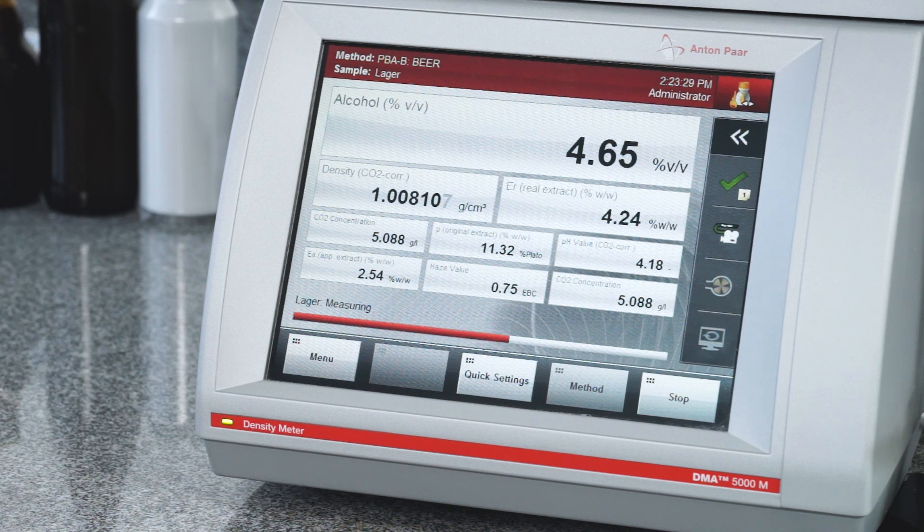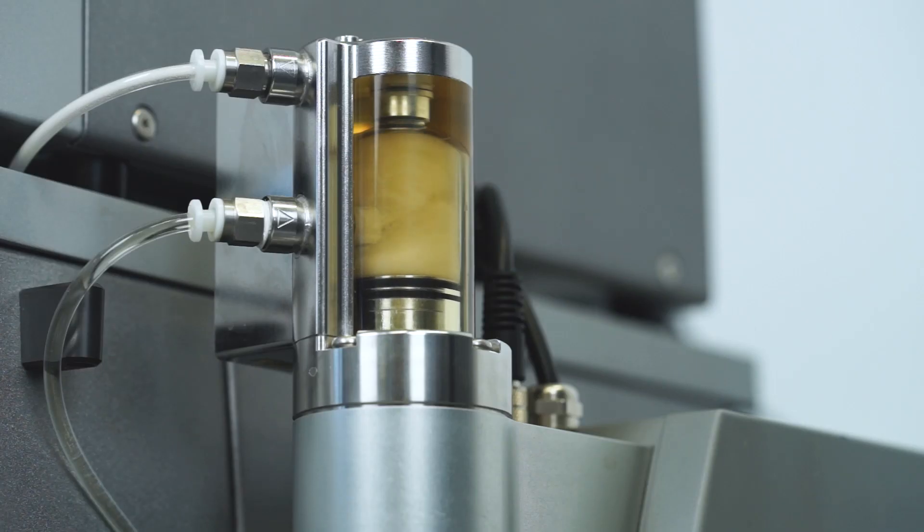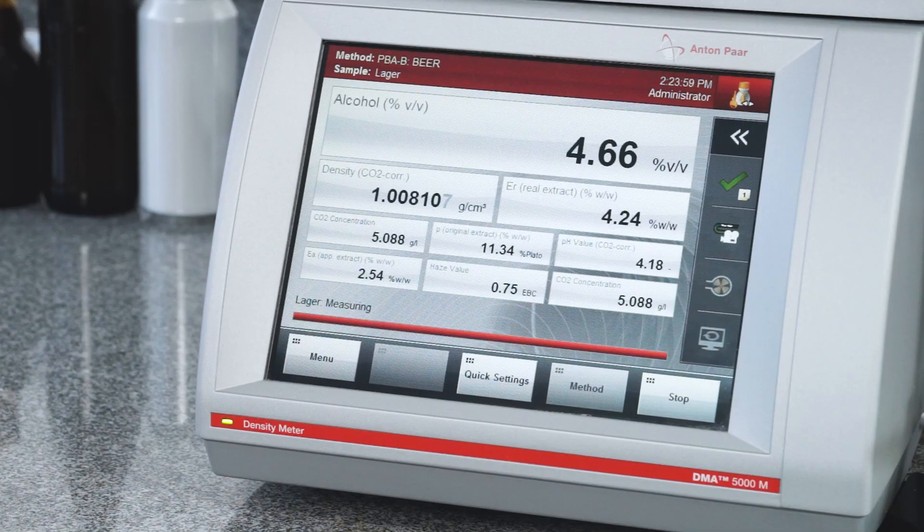As soon as the automatic filling procedure is completed, the PBA-B system will start the measurement sequence of all devices. The CARBO-QC-ME performs the multiple volume expansion to measure the real dissolved CO2 content without being influenced by the presence of nitrogen or oxygen in the filled sample, while alcohol content, density, extract, and optionally pH, color, and dissolved oxygen are measured simultaneously.